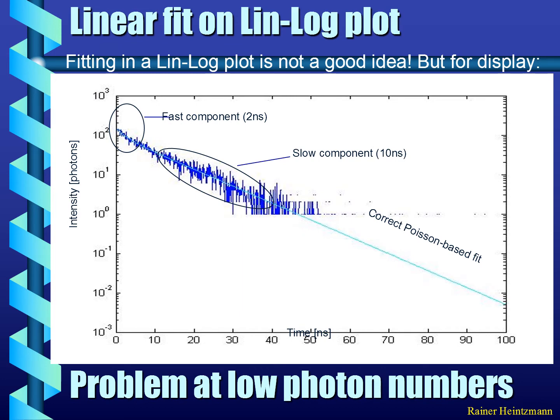And so here you see a pretty good fit of a lifetime curve. However, it is very convenient to show FLIM plots on the semi-logarithmic scale. However, you have to be really careful to not perform a fit on the logarithmic scale. And the reason for this is shown in the next slide. So as I say here, fitting in the lin-log plot is not a good idea. You can use it for display though.